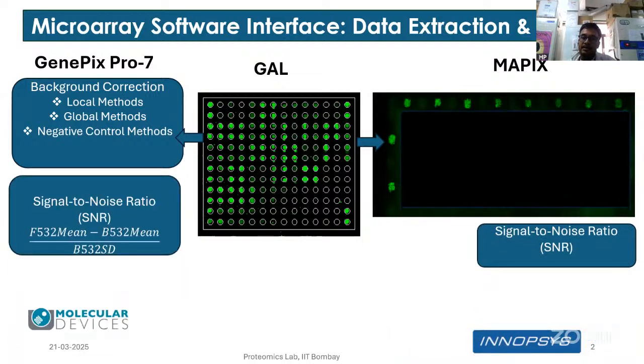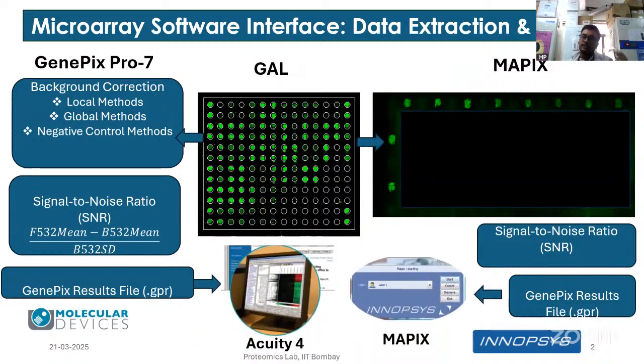In this particular project, which we are considering for COVID-19, we look into the pattern of different proteins printed on the chip. The steps are: first, scanning of the slide, then generating the image, which is called a microarray image. This is one part of the image. In a live session I will show it briefly; you can see the whole chip, with different blocks.